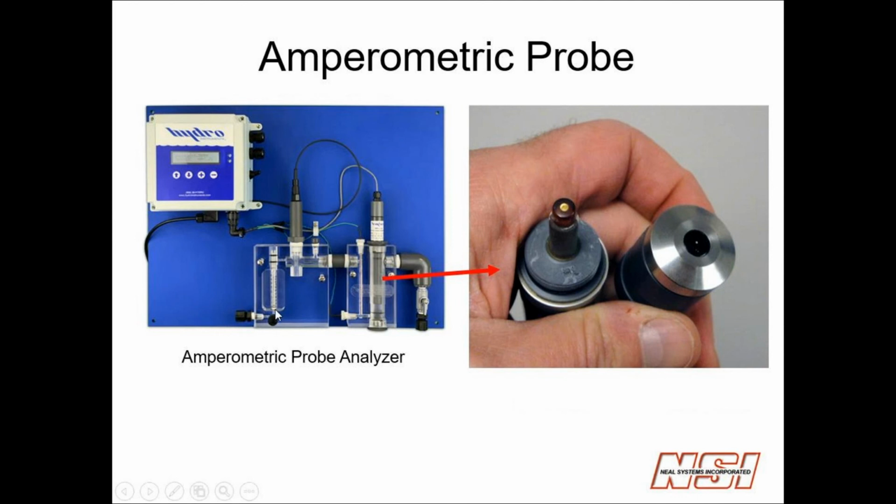So your water would enter in, go through a rotometer where you can adjust the flow rate. This one happens to have a pH probe as well, and then it flows through, comes down and enters into the cell, and there is a constant head device here as well. So as this fills the cell, it overflows and goes to drain.